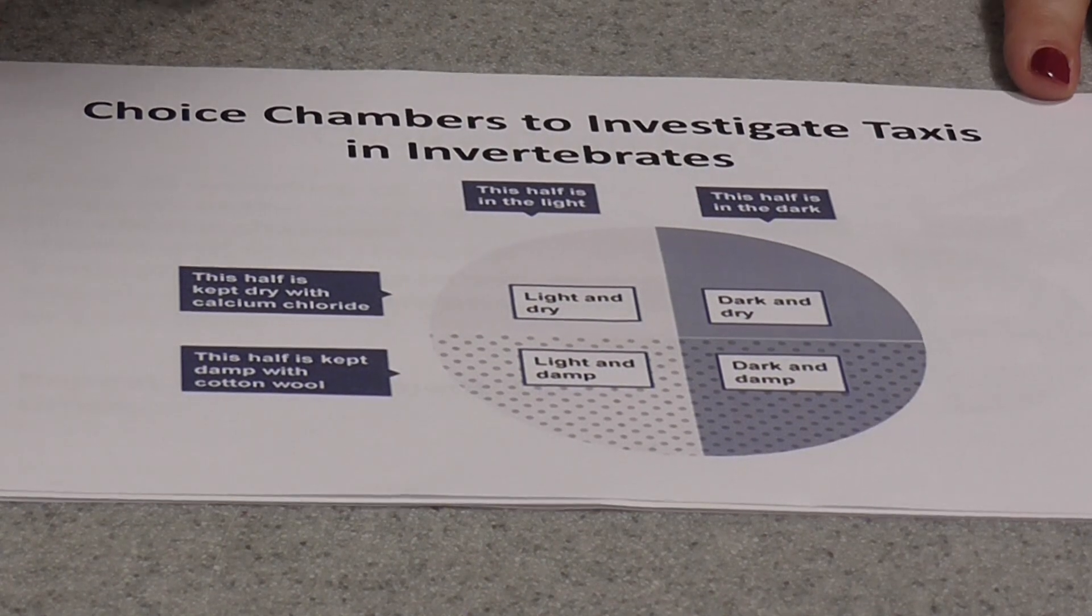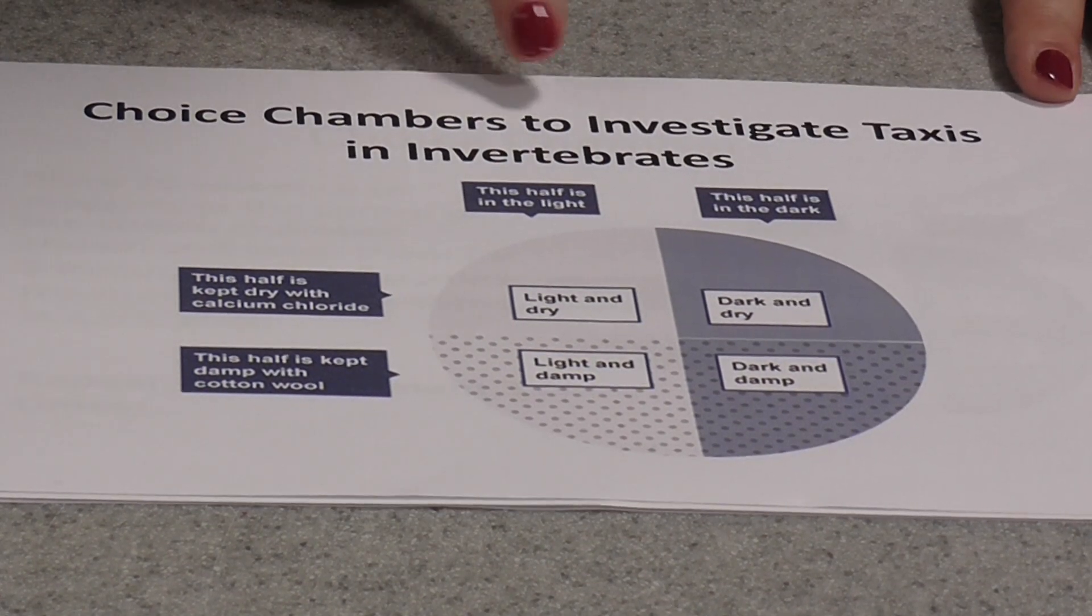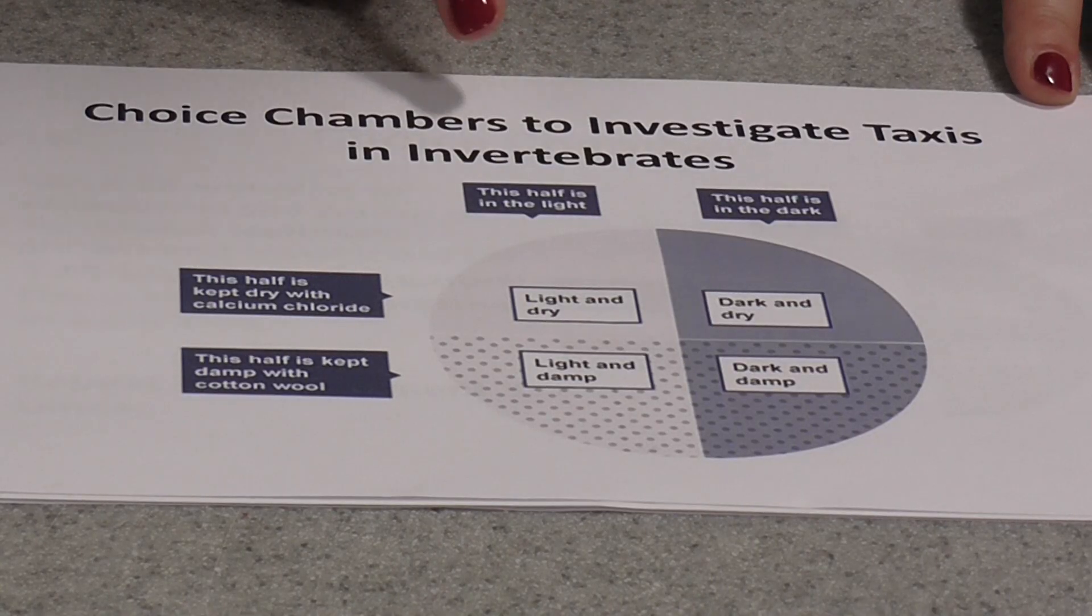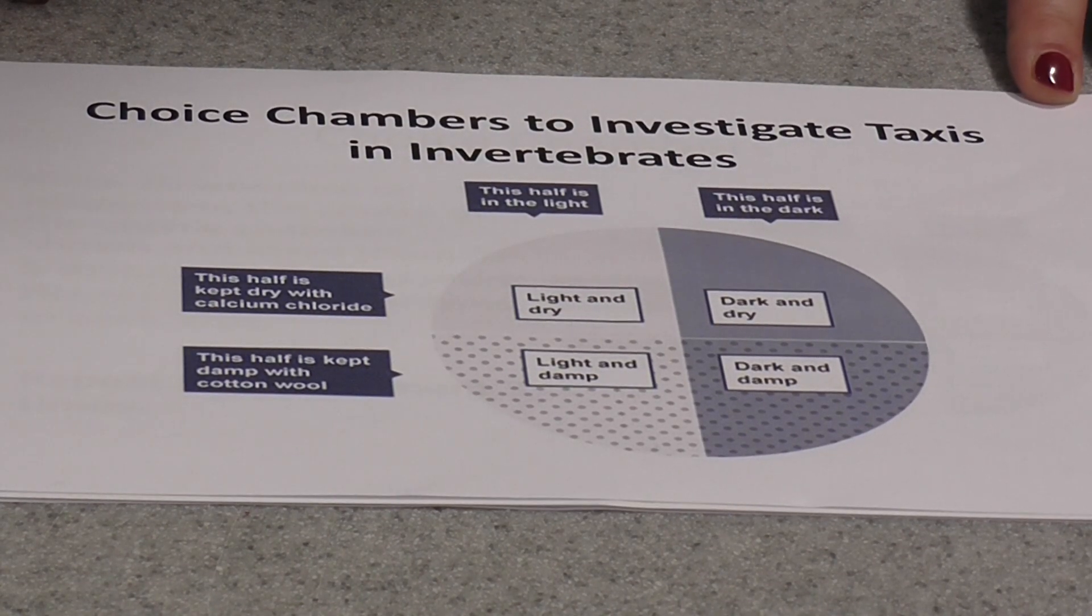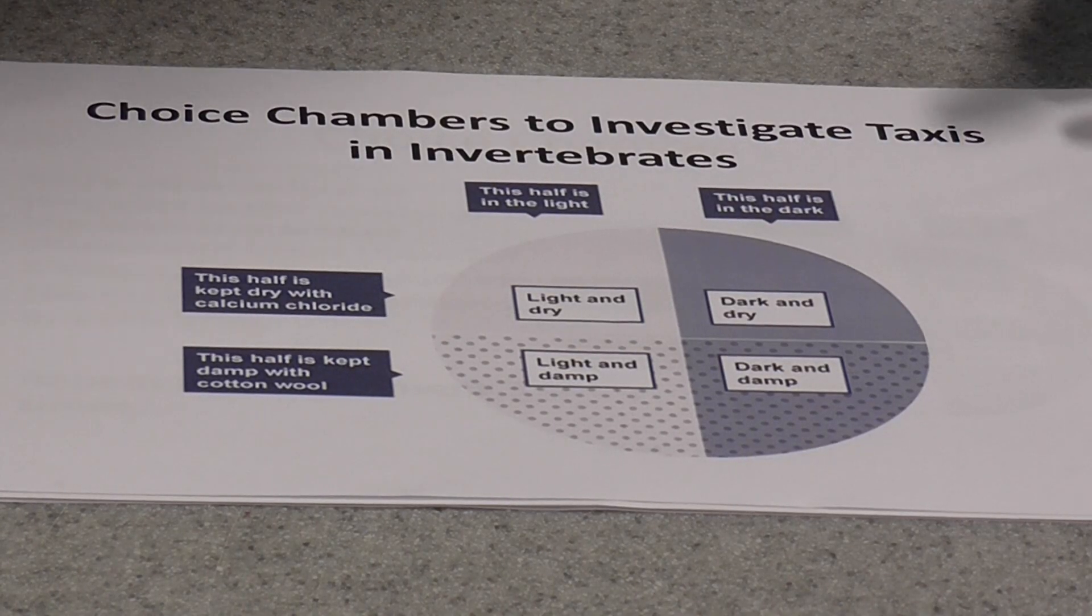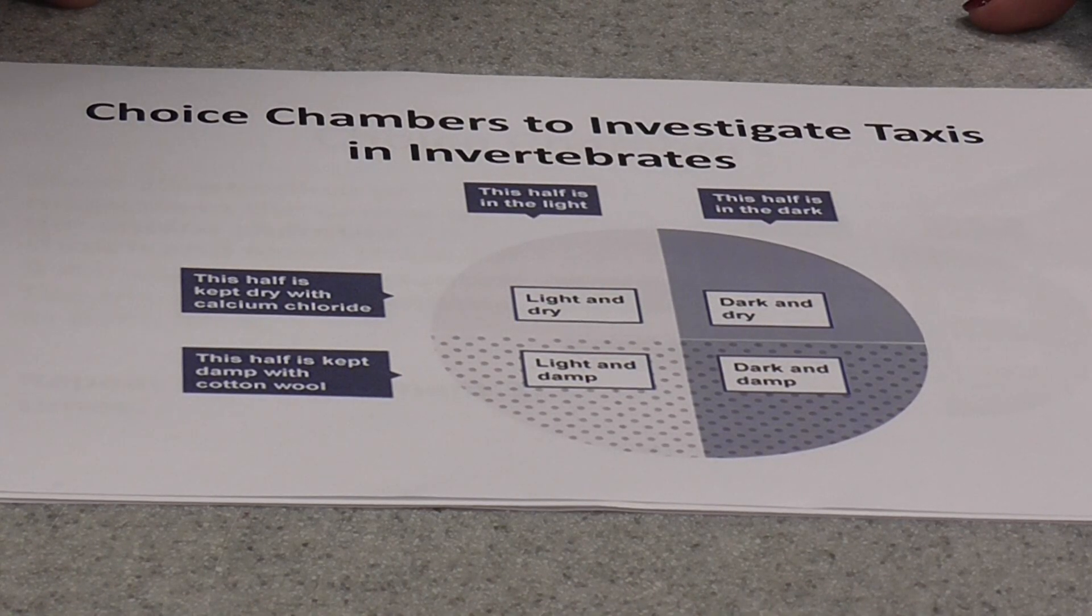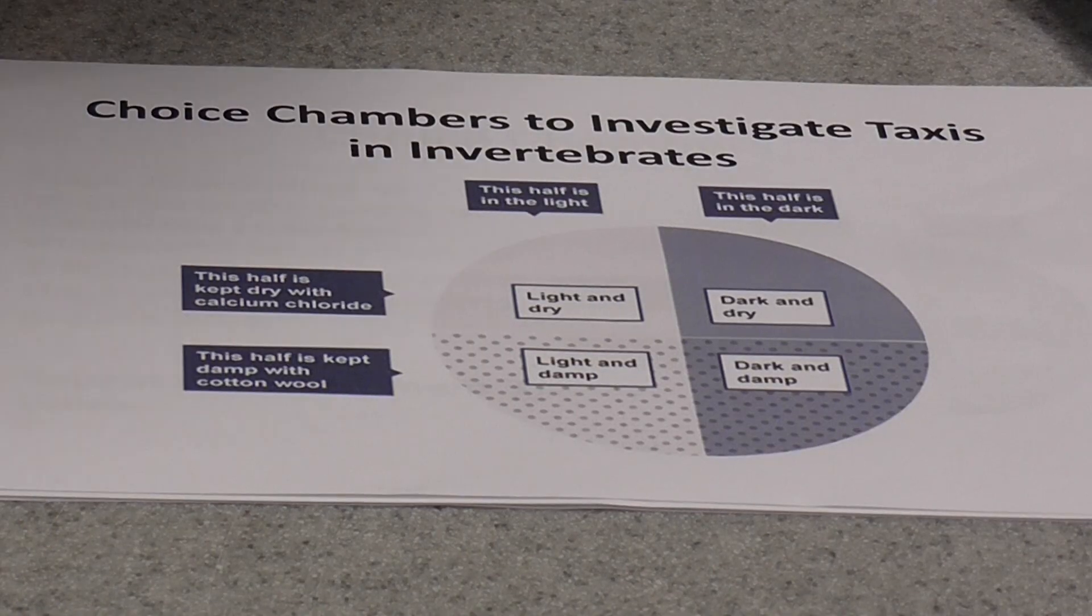I'm going to show you how to use something called choice chambers to investigate a simple animal response called taxis in invertebrates. The best invertebrates to use for this are maggots from the local fishing tackle shop or you can go out and collect wood lice.